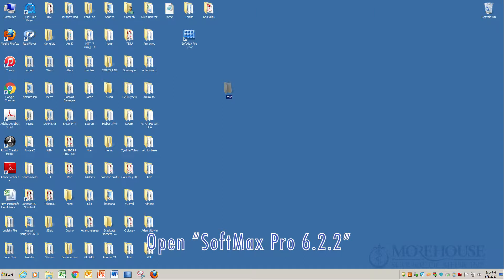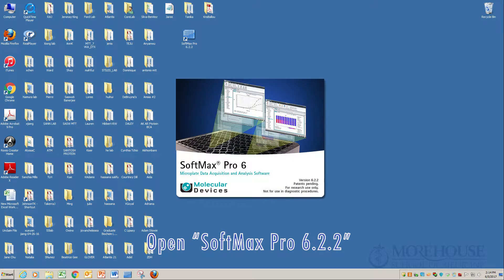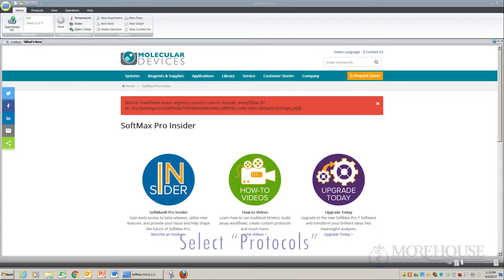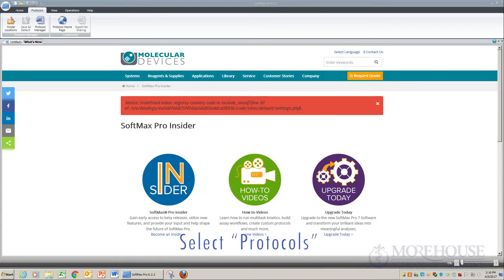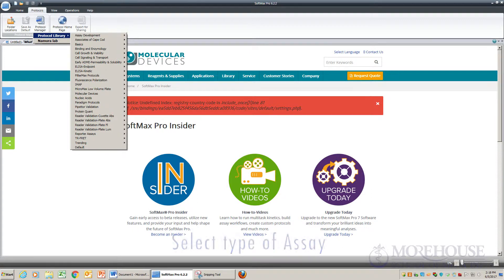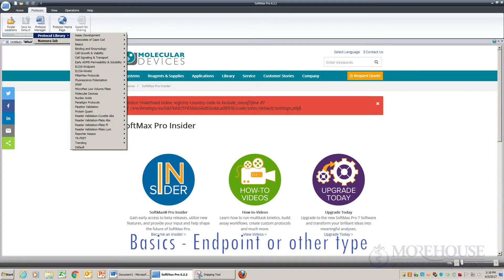Open SoftMax Pro 6.2.2. Click Untitled 1, then select Protocols, Protocol Manager, Protocol Library. Select the type of assay — Basics, Endpoint, or other type.